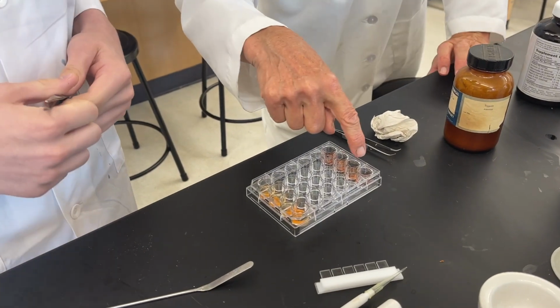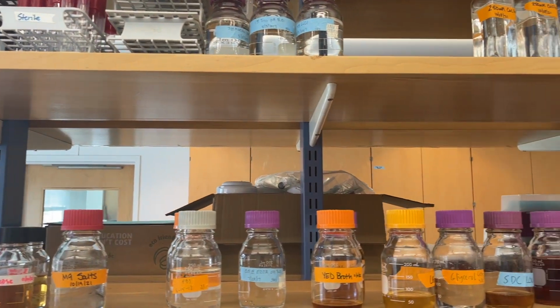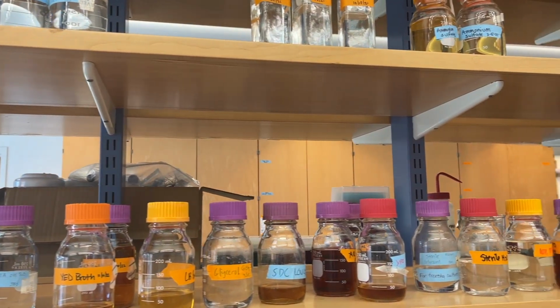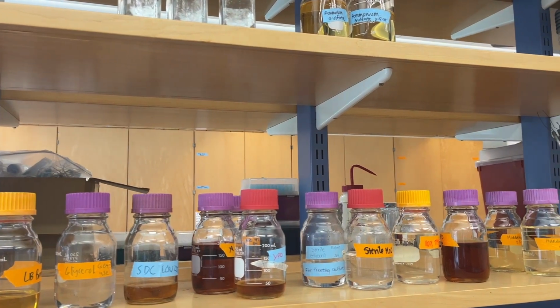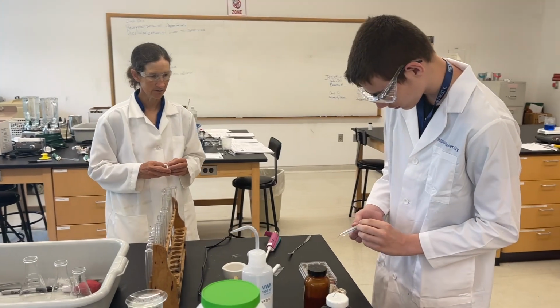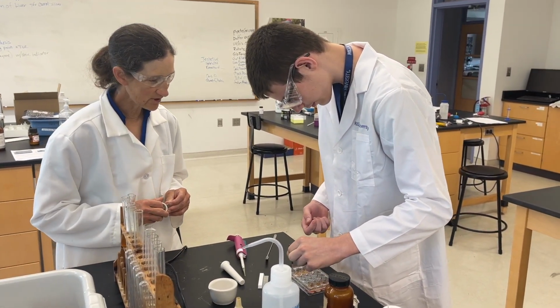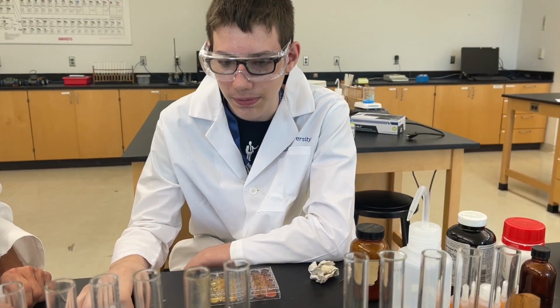The third project, the biochemistry project, is decellularization of liver and carrot slices. So this is a total idea from a student. He wanted to work on this, so I looked some stuff up. We got the materials, and we're trying a really new experiment. So the purpose of it is to remove cells from tissue, and then use what remains after you remove the cells to be able to build or grow human cultures. So the idea is to be able to print mammalian cells into structures like organs.